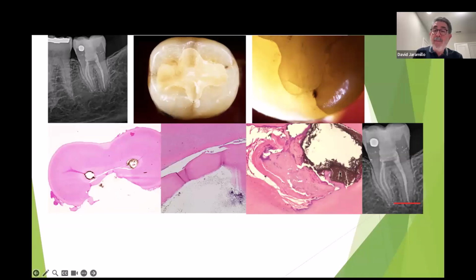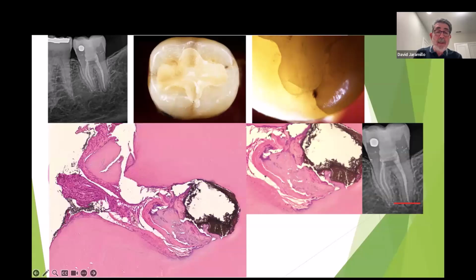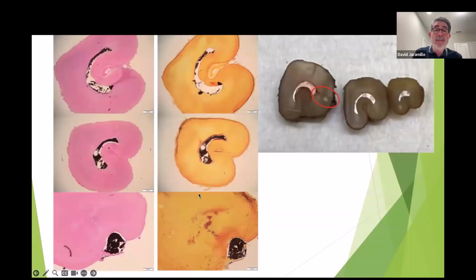And this is the most apical portion in the distal root canal. So the foramen is located laterally, as we can see here. So here is the sealer, and all this is the pulp tissue. The tissue is a little bit inflamed. There's a lot of inflammatory cells here. And so it respects the multisonication. A lot of people ask me about the possible extrusion. It doesn't go beyond this point.